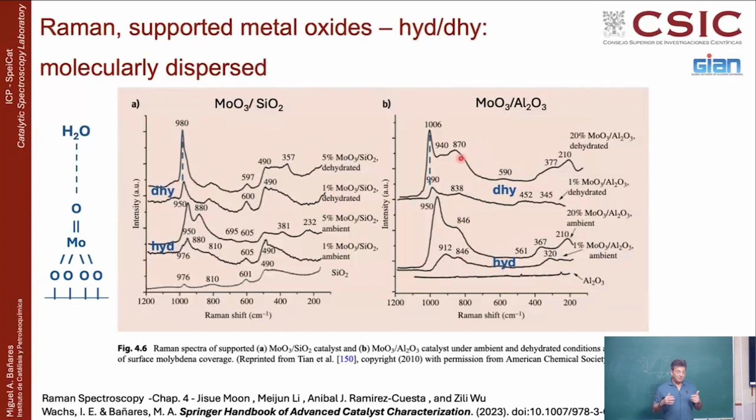But even when things look similar, they are not the same. And people were typically confused because they were not aware of how important ambient moisture is. They were looking at this, or they were looking at that, and they didn't realize they were looking at the same sample but with a different degree of hydration. So people said, okay, the band is somewhere between 950 and 1006, and they were happy because they didn't know about that.